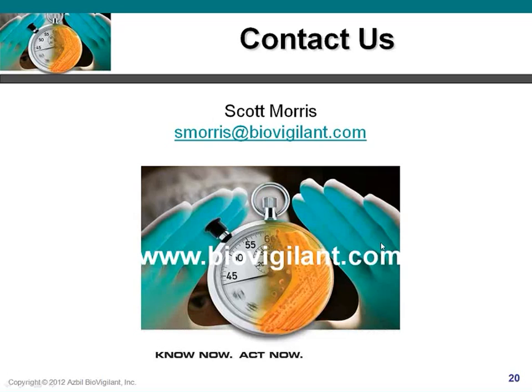traditional air samplers. And some of the non-traditional applications, those that were on the right-hand side of the graphic we were looking at, the investigations, gowning training, etc., traditional growth-based methods may or may not even be part of those applications. So it wouldn't necessarily be an issue of replacement there. It would be an issue of generating new value by using a new technique in those different applications. So it depends, but the possibility is there if the user is willing and able to take the time to generate the data to support reducing or replacing the traditional technique.